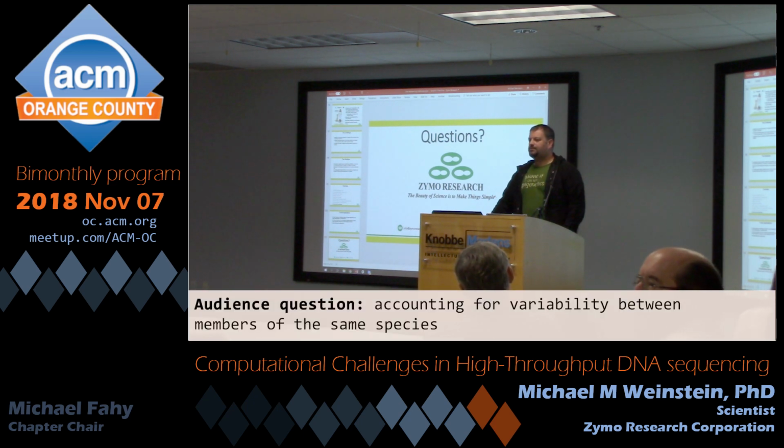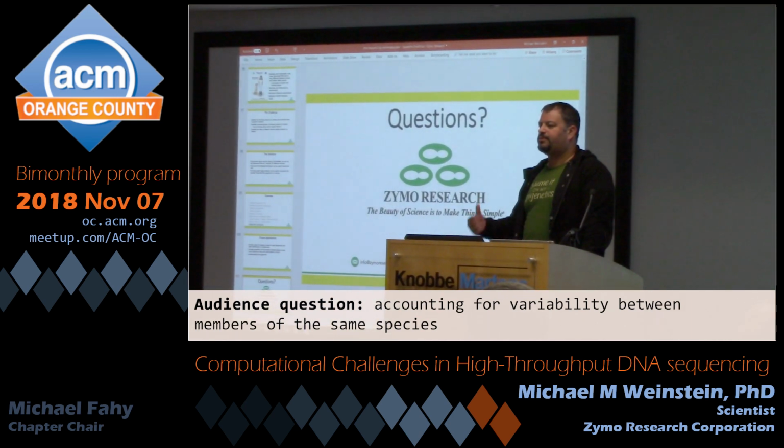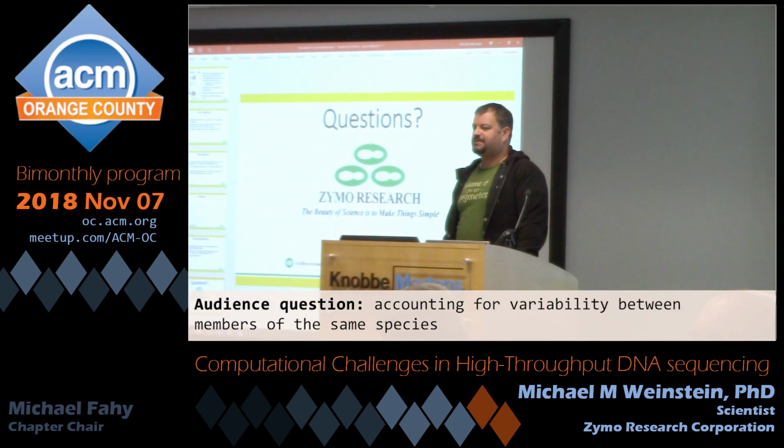So you can usually say with some probability how much you've missed. And you can usually get that probability pretty low. And in the case where you're trying to do the reads and generate a De Bruijn graph, typically there you'll be able to notice gaps.